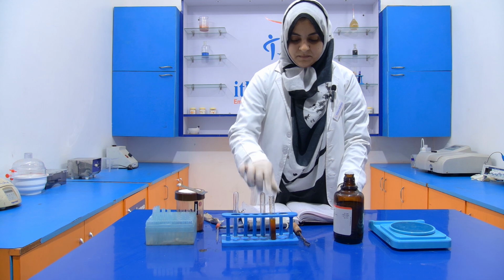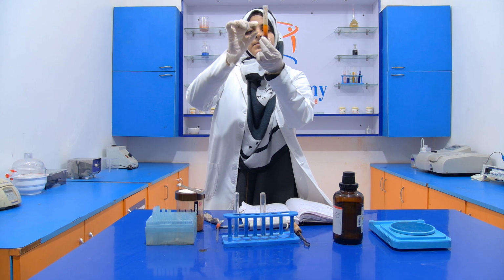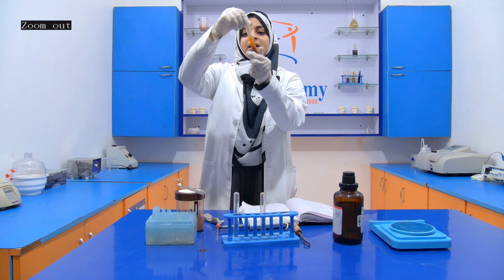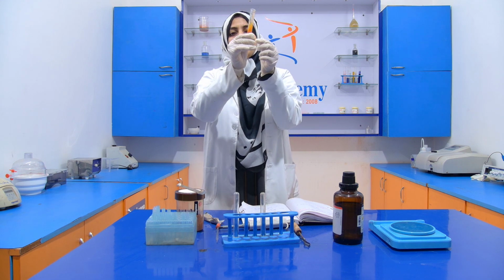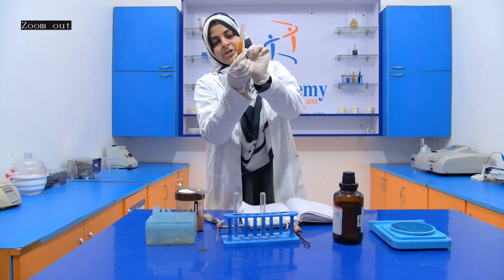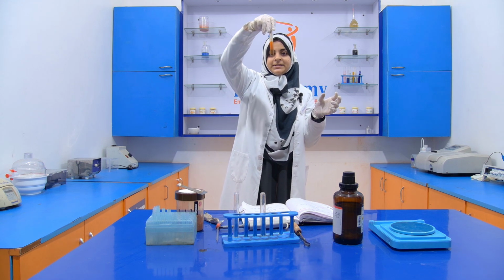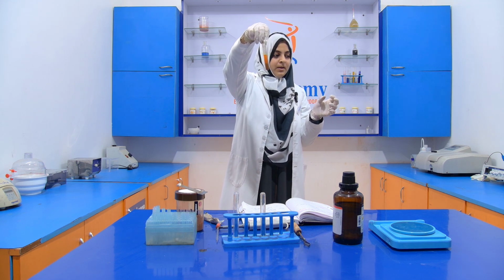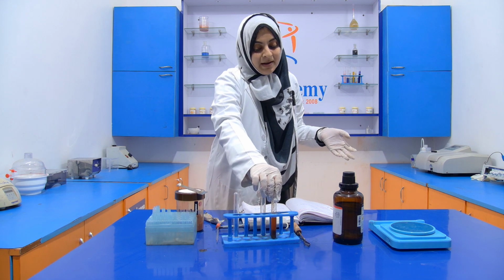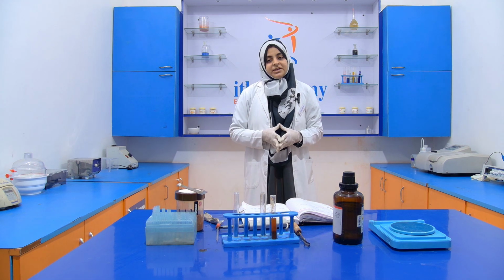Now mix it properly. See that it separates into two layers. The upper one is slightly orange in color and the lower one is the red chili. Now this solution shows us some reddish color. See that this is the reddish color, which indicates that our sample contains rhodamine B. You can see that it is slightly red in color, which means that our sample is adulterated with rhodamine B. We get a positive result.